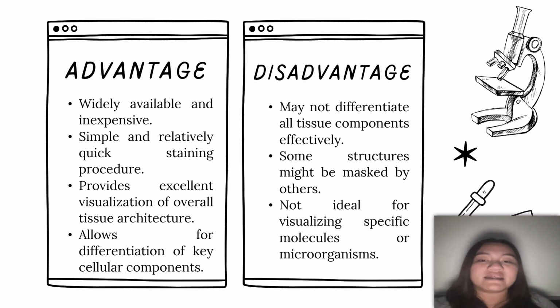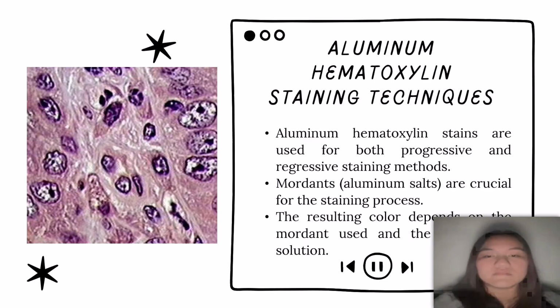On the other hand, it also has a limitation, like what I've said earlier, that it may not differentiate all tissue components effectively because some of the structures might be masked by others, and also it is not ideal for visualizing specific molecules or microorganisms.